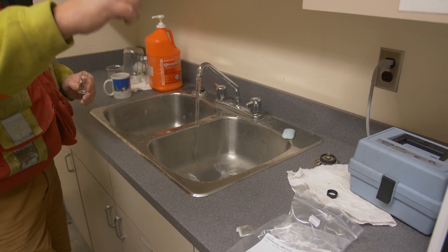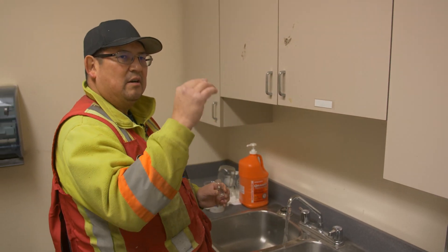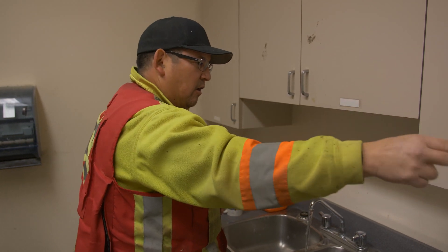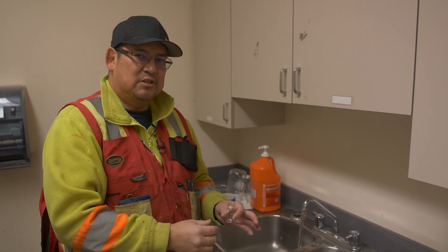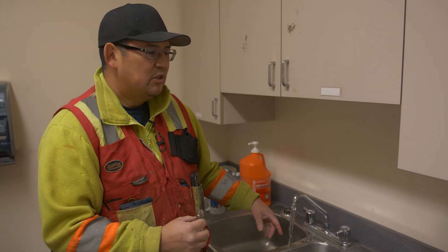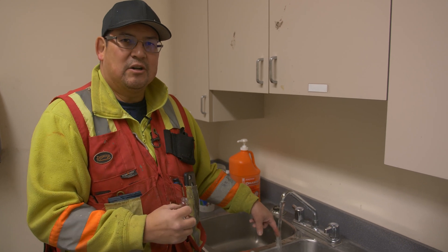You have to run your taps about a minute or so because you have stale water from the other room that has to flow all the way through — getting rid of the stale water. If you touch it you can feel it's sort of room temperature. What I'm looking for is nice chilly cold water, and that tells me I'm getting fresh water now.